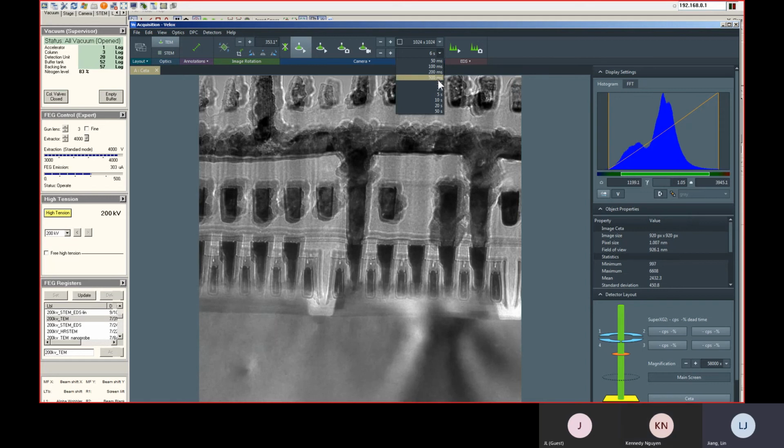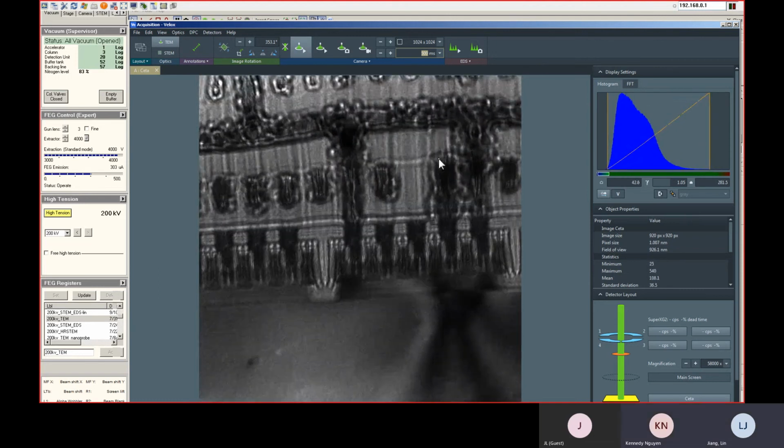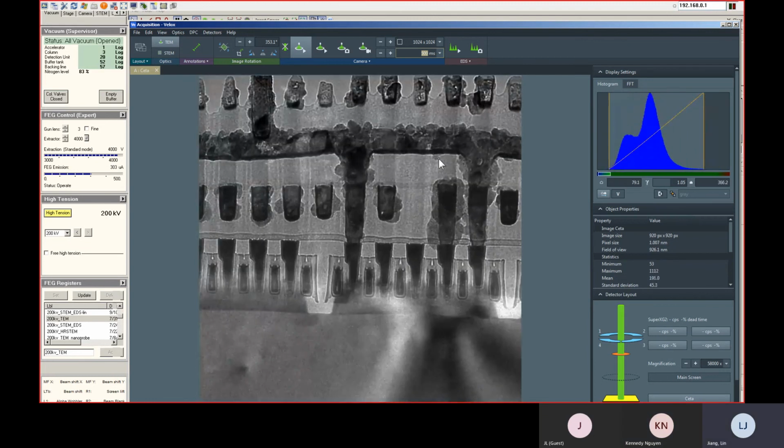Maybe 1 second or 500 milliseconds. So about there. Okay.